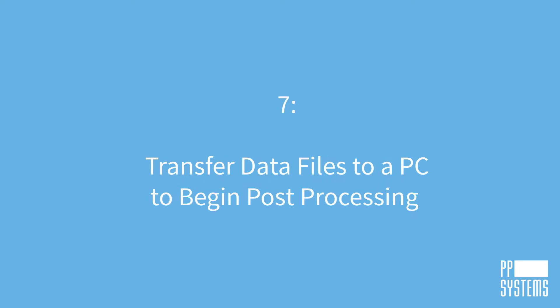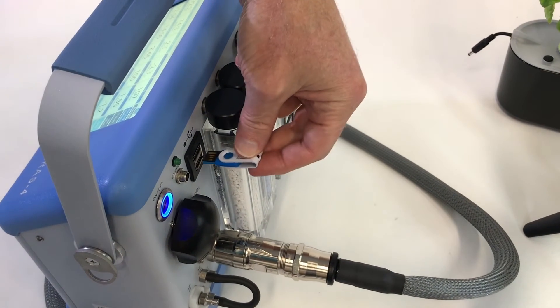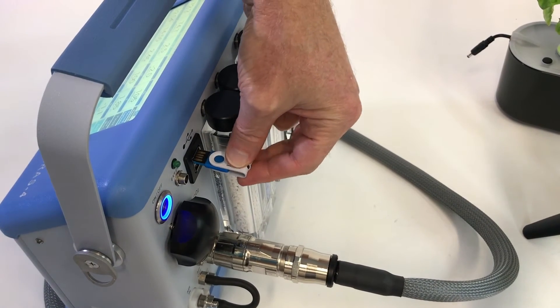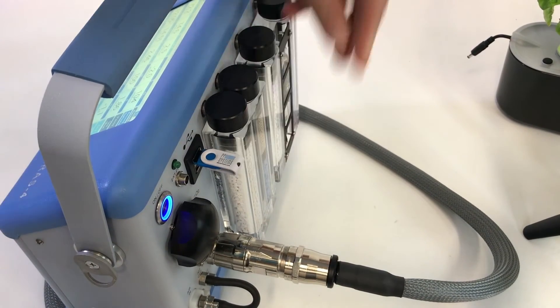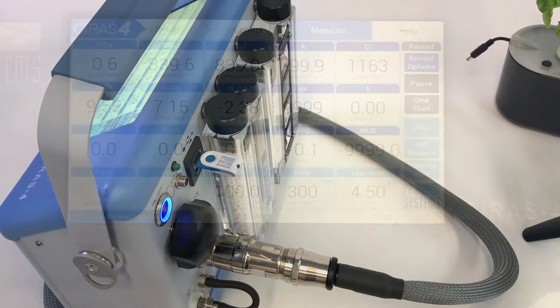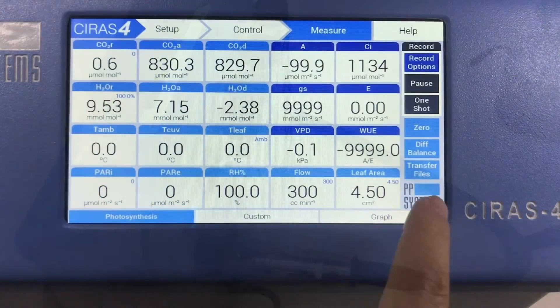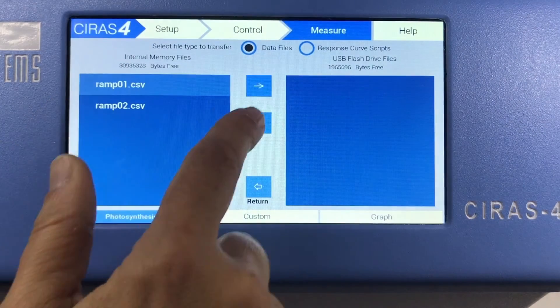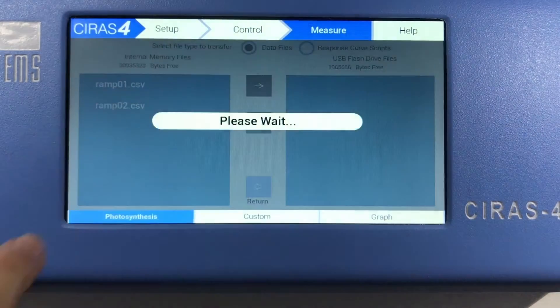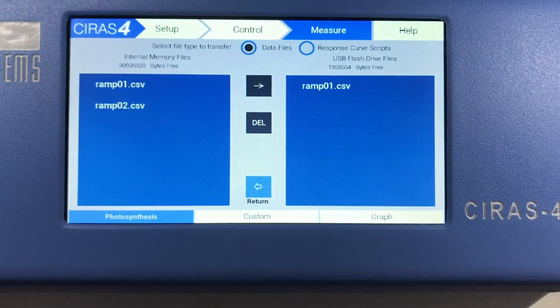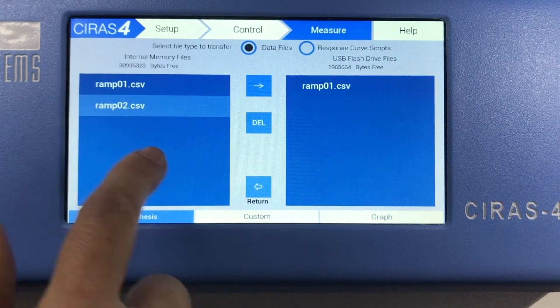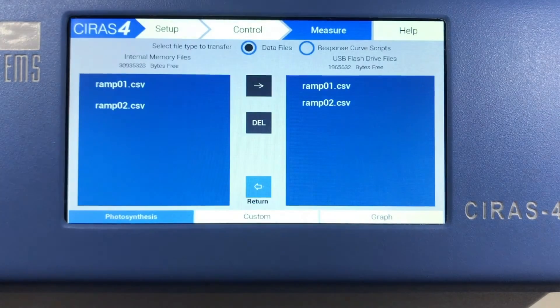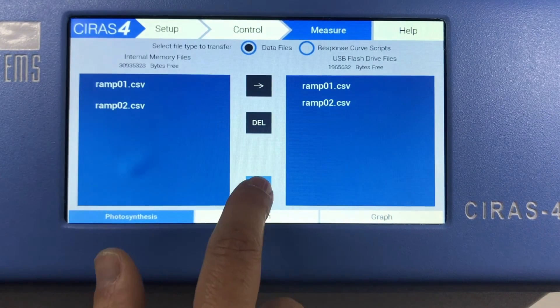Next, we'll transfer data files to a PC to begin post-processing. Insert a USB flash drive into either slot on the back of the CIRIS-4 console. Tap Transfer Files on the command menu. Highlight the data files recorded in the previous steps and tap the Transfer button to move the files to the USB drive.